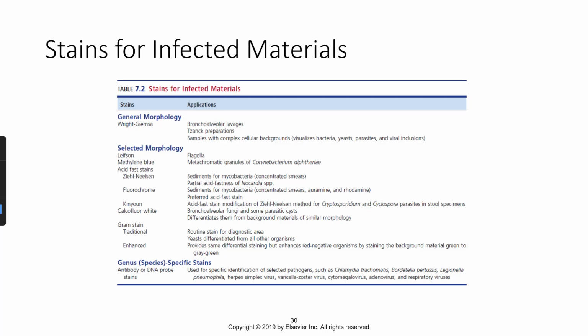And then this is just a good table that you can look through if you're curious to learn a little bit more about the different staining procedures that we use.